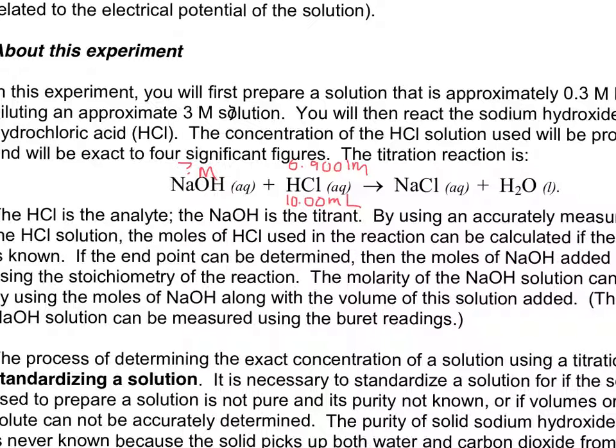So I'll talk you through making your own sodium hydroxide solution. You have to find its molarity. Sodium hydroxide is going to be in your burette, this is my burette. You are going to drip sodium hydroxide into your HCl solution, your 10 milliliter aliquot, and look for a pink color. Okay, so basically the amount of titrant that you drip in is going to be your volume from titration.